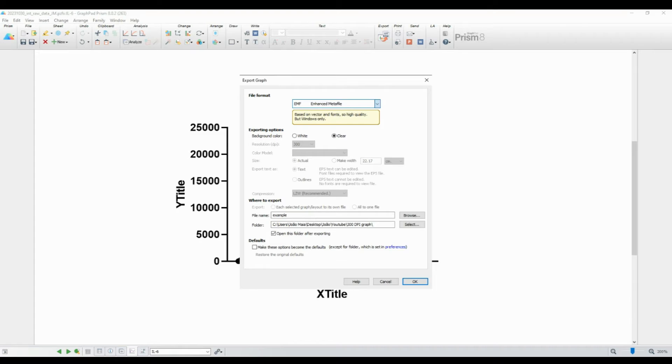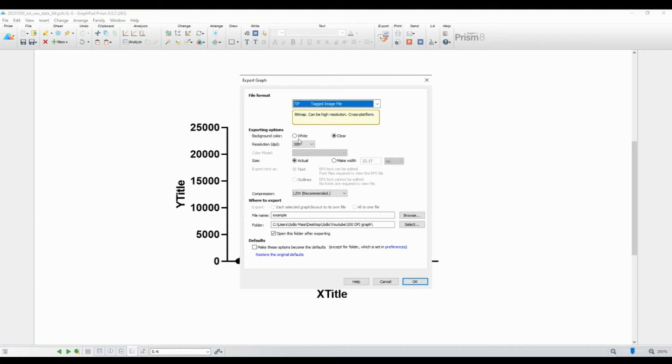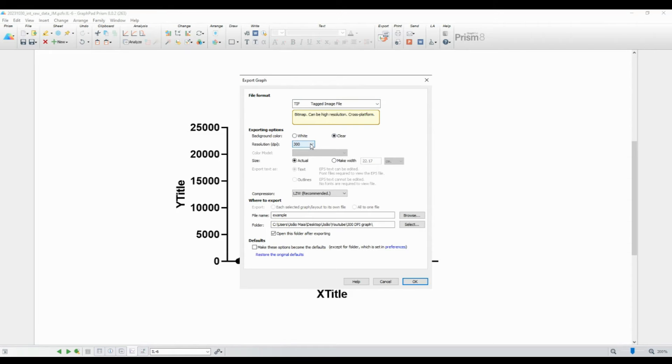Below the file format selection, you'll find the option to set the resolution. Make sure to set it to 300 DPI for high-quality. Now, click the Choose button to select where you want to save the exported file and give it a name.